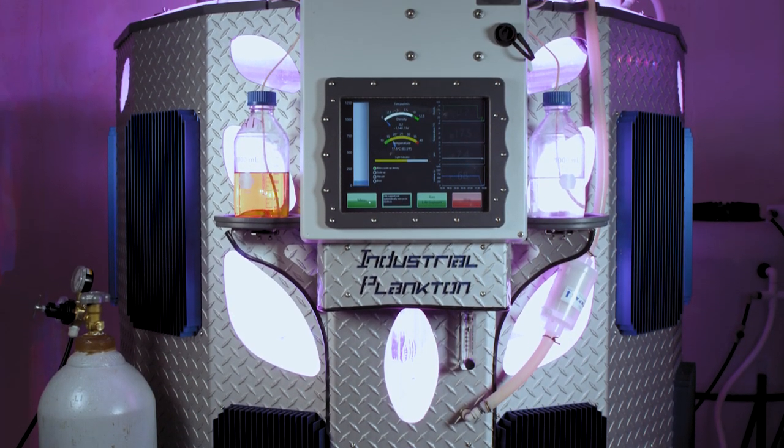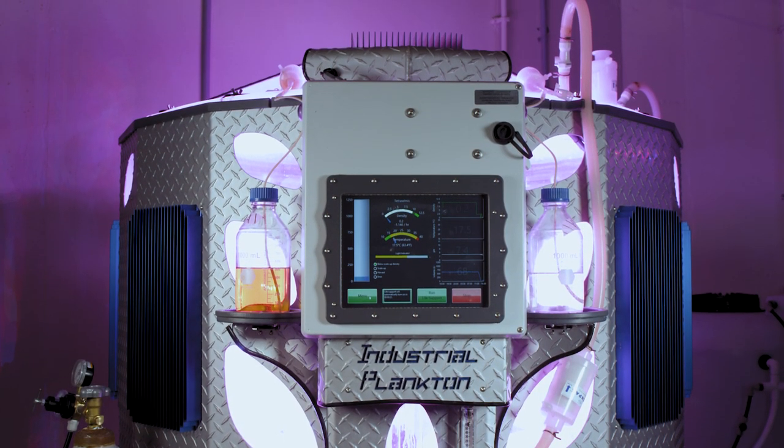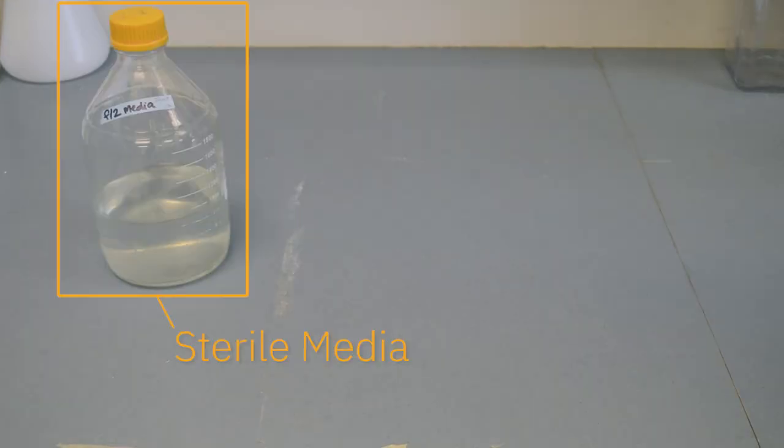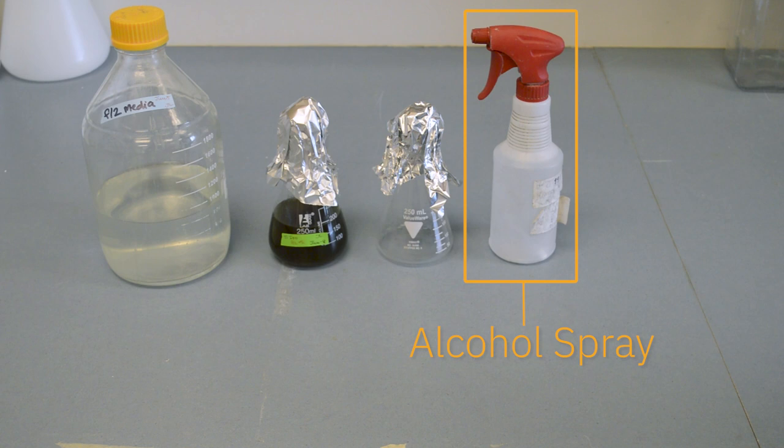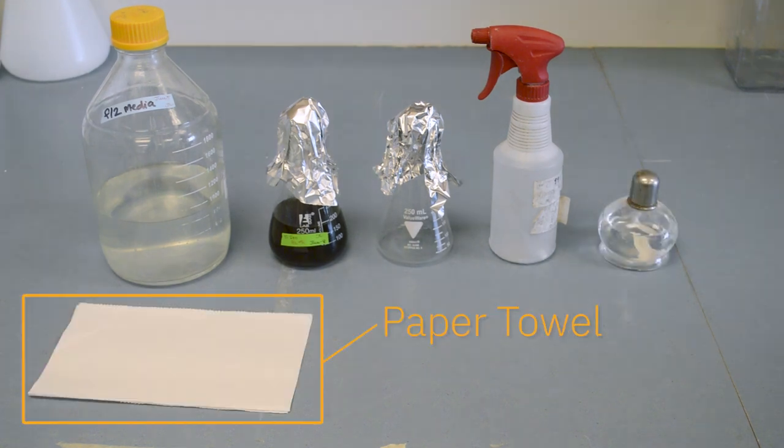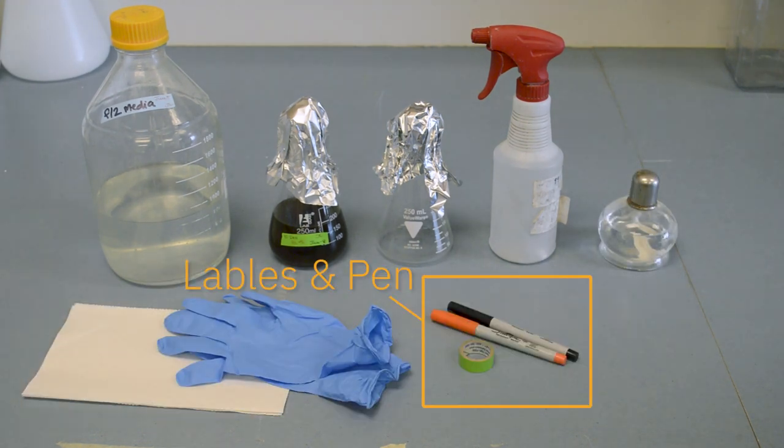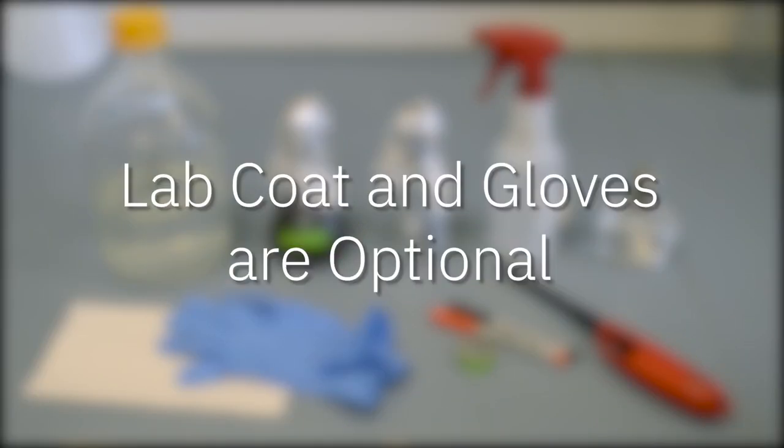To transfer your algae you will need an empty workspace, sterile culture media, your parent culture, a sterile empty flask, alcohol spray, a flame source, paper towel, gloves, labels and a pen, and a lighter. Lab coat and gloves are optional for this procedure.